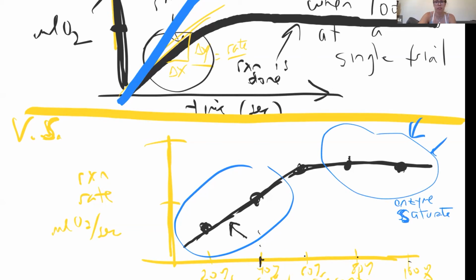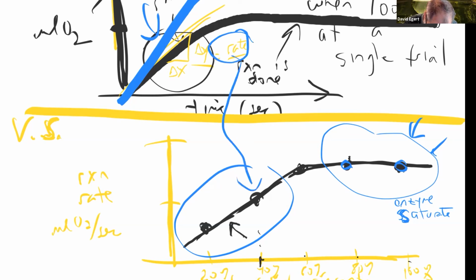Yes. Absolutely. Remember this dot, how do you calculate these dots? These dots are the slope. So to get that value, each of these slopes is a delta y over a delta x. So the reaction's happening, but it's the same rate. Same rate, yeah.